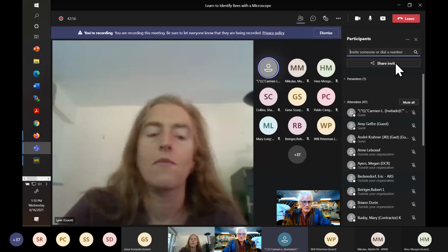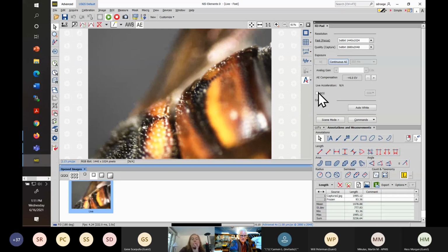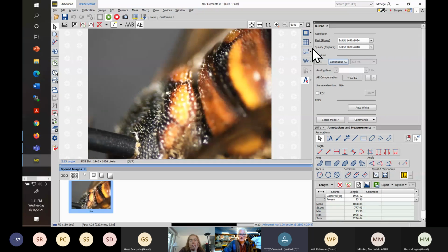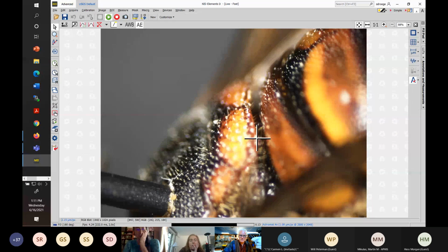Okay, we're going back here to the microscope. I'm attempting now to show the lamellate scutellum from the side. So here we are again. It curves over, so it's not going to show well, I think. Here's the abdomen. Also, yep, make the microscope bigger. Oh, I got it. Thank you, people, for helping on that. And get rid of that. Okay, good. Oh, that is much better.